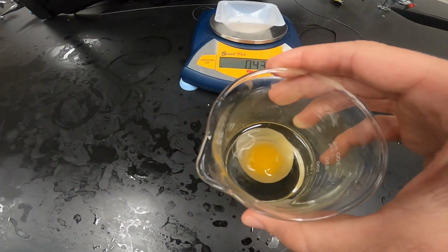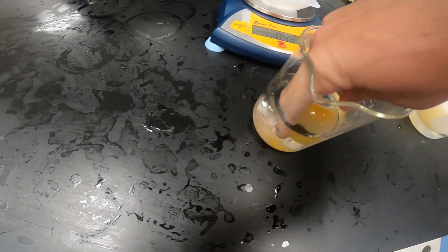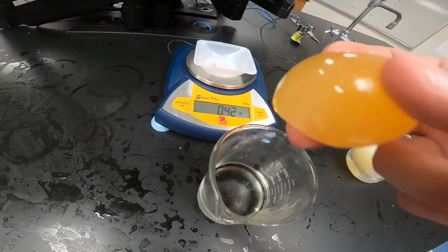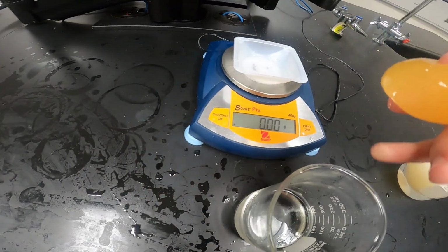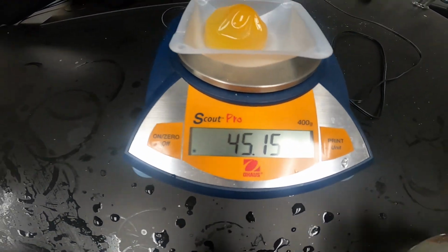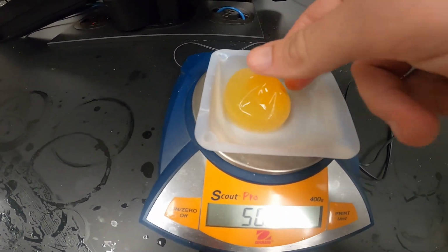Then we have our corn syrup egg. You can see it looks very deflated. I'm going to try to get it out without breaking it. But you can see it's like a deflated soccer ball. Zero out our scale, and then place that one on there. And now we have a mass of 45.15 grams. And again, you can see that very deflated looking egg.